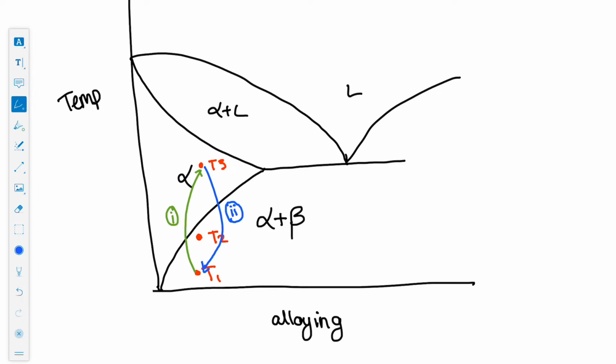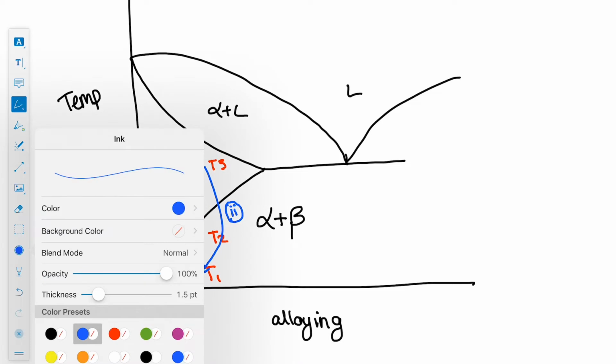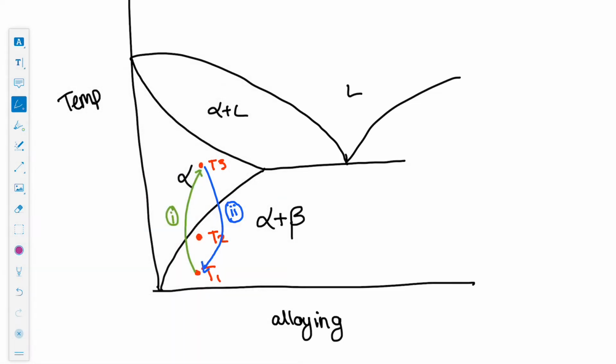And from this, we are able to heat our material back up to a temperature below our T3, and this is what causes precipitation of those finer, more dispersed particles that we see in our resultant samples.